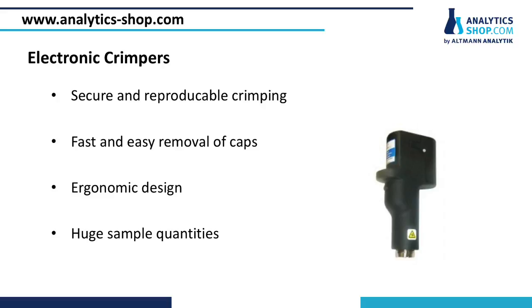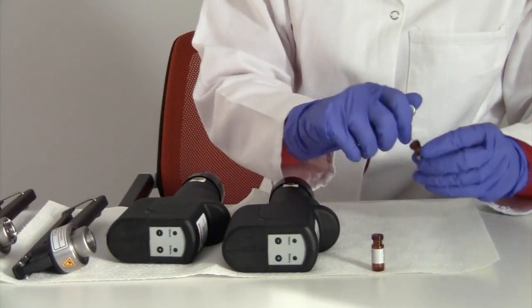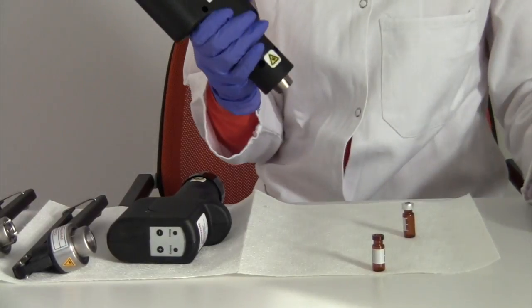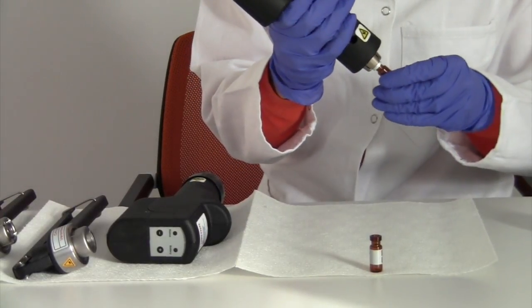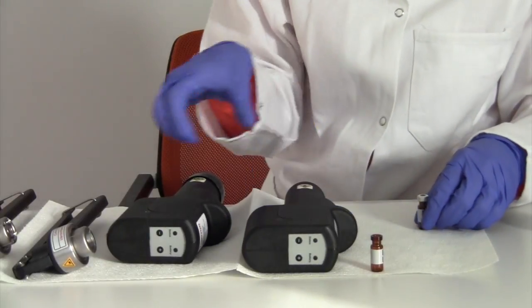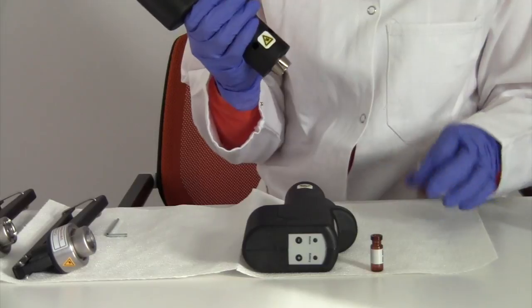The handling of electronic crimpers is in many ways similar to the manual ones. Again, the first step is to set the cap on the top of the vial. Use the crimper and close the vial by pressing the button. Based on the same principle, the cap is removed.